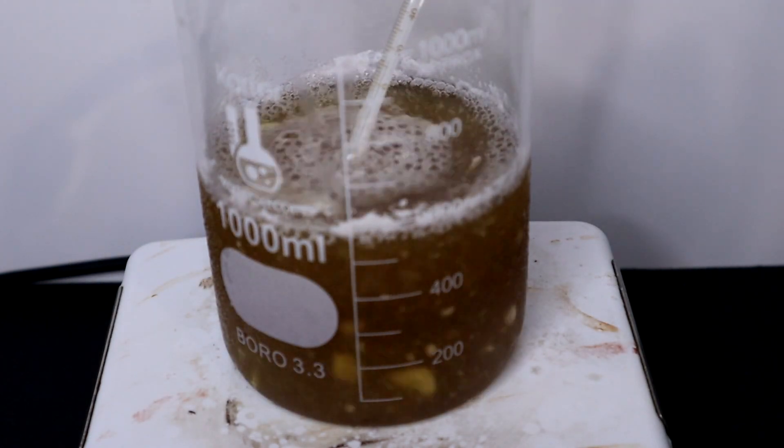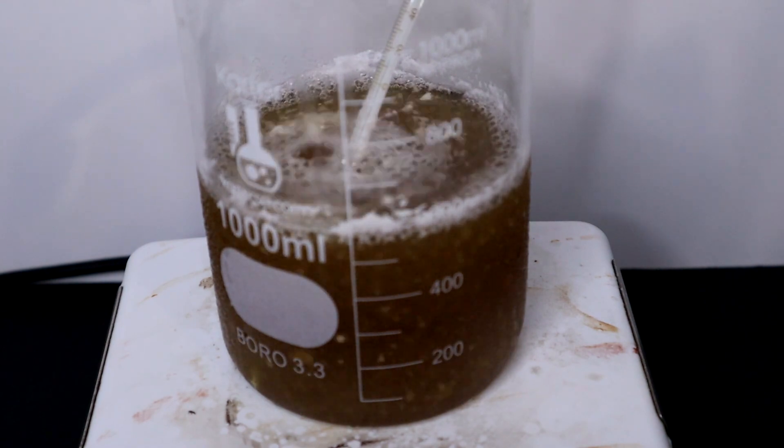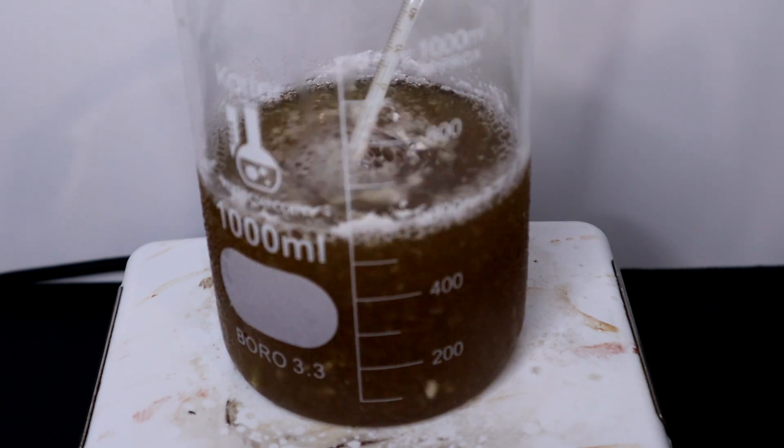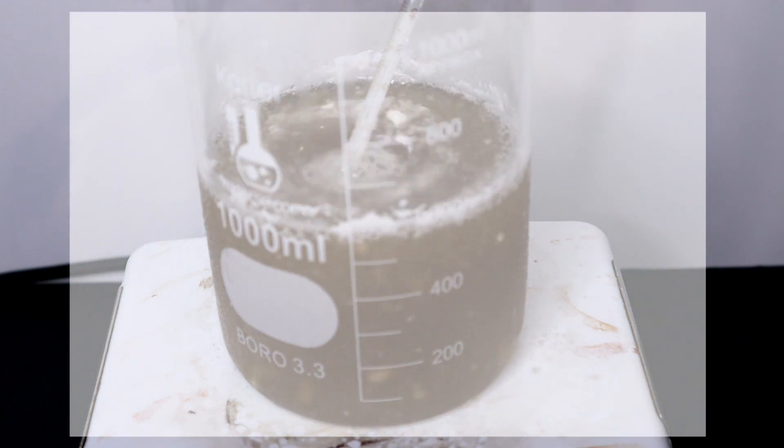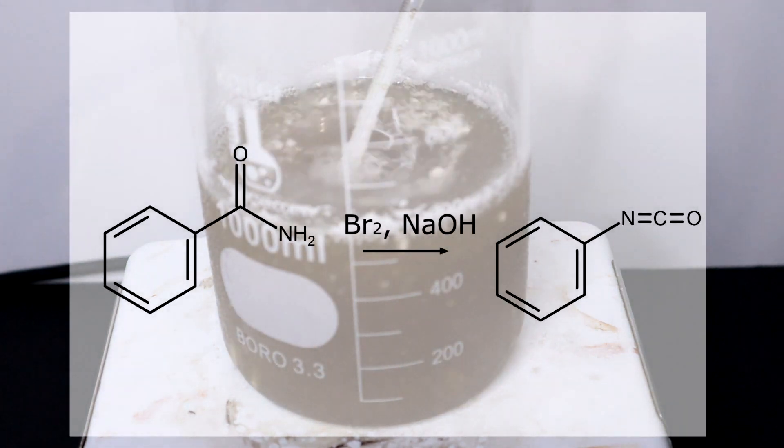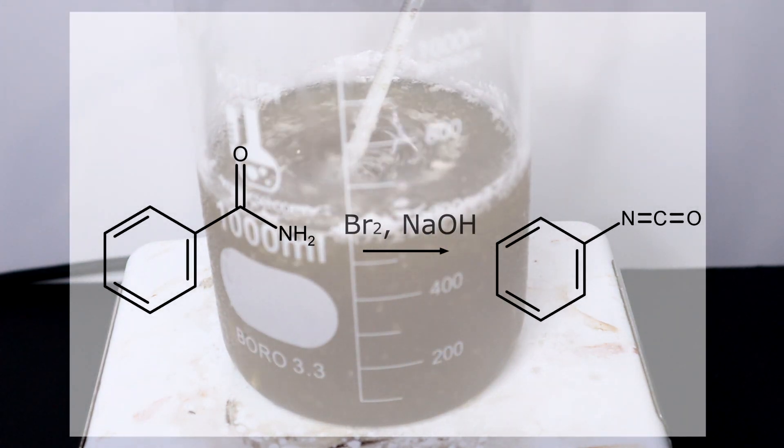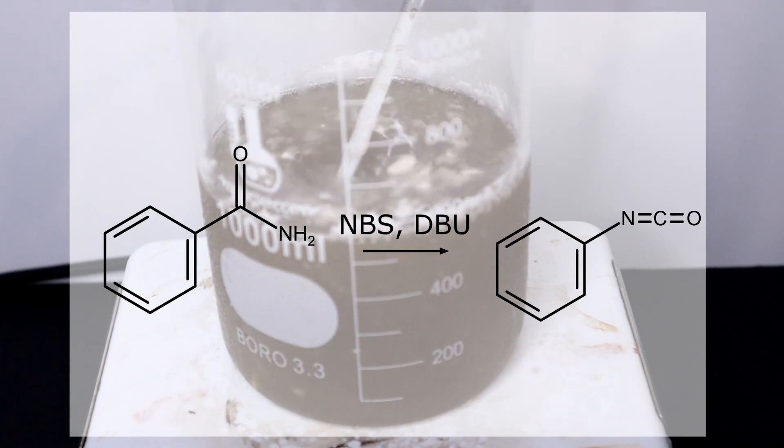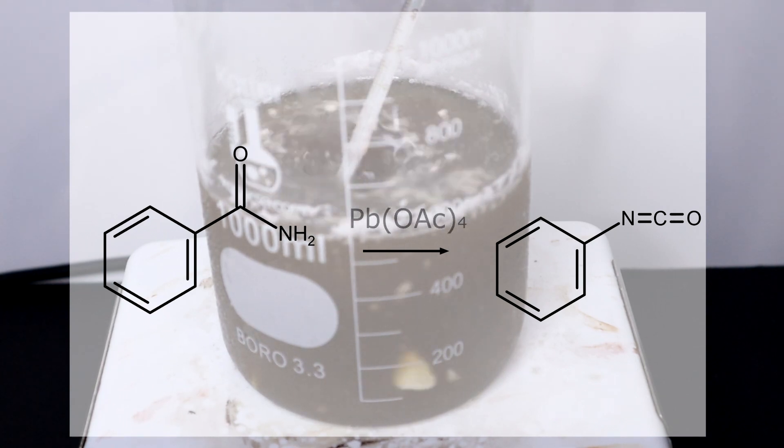Now I used sodium hypochlorite and sodium hydroxide but there are several other reagents that can achieve the same transformation. These include bromine and sodium hydroxide forming sodium hypobromite in situ, and bromosuccinimide in the presence of a strong base as well as other reagents such as lead tetra acetate and bis trifluoroacetoxy iodobenzene.